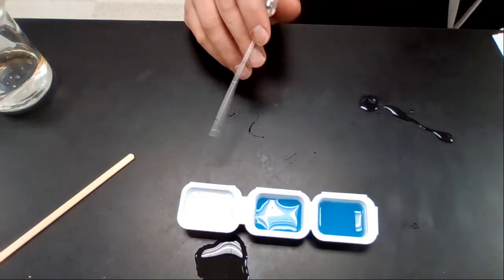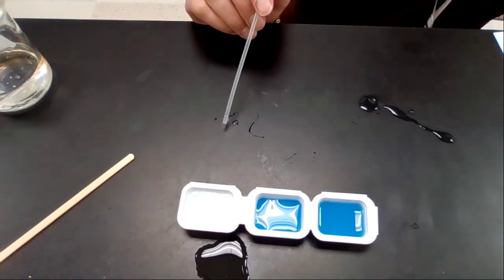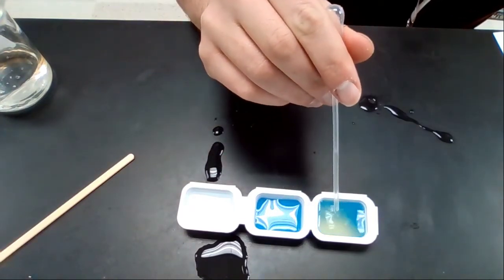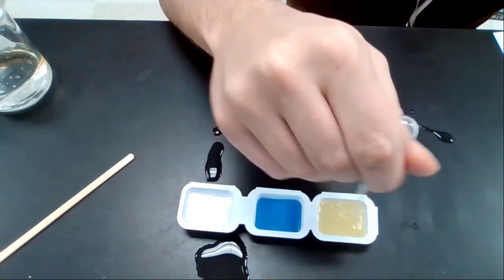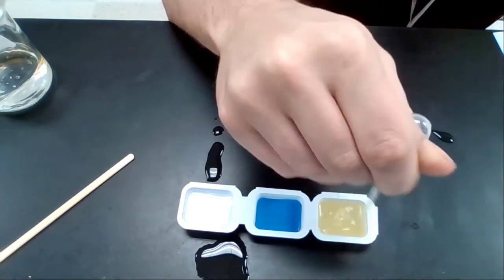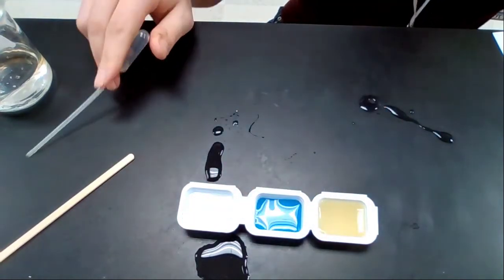And it continues to do this, and it says continue to add vinegar until a prompt color change is no longer visible. So I don't think I need to add a whole lot more here. Well, maybe. Keep stirring. Okay. Not getting that prompt color change like we did before.